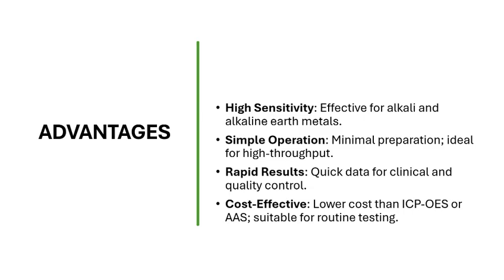Coming on to the advantages. It is highly sensitive for alkali and alkaline earth metals. Simplicity in operation, requiring minimal sample preparation. Rapid and cost-efficient analysis, making it ideal for routine testing.